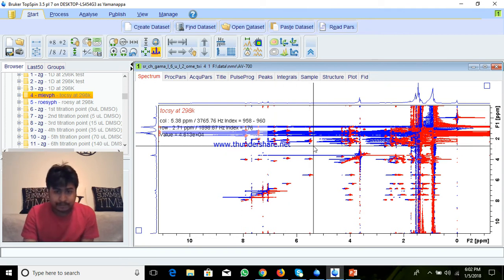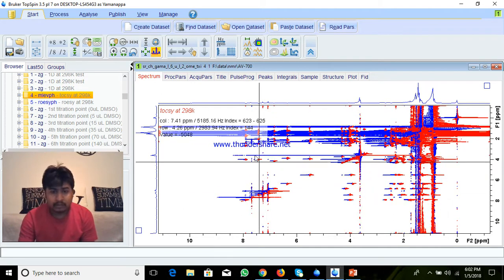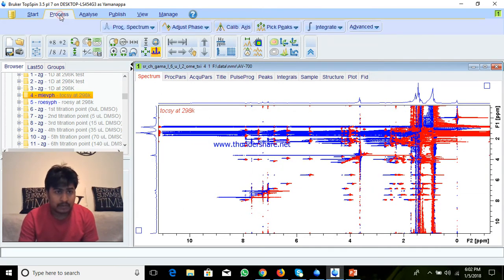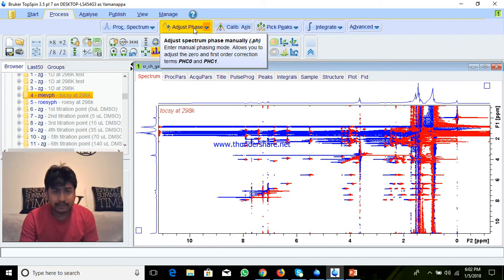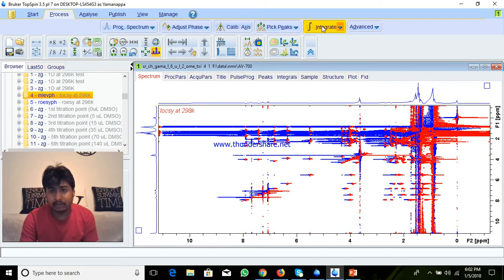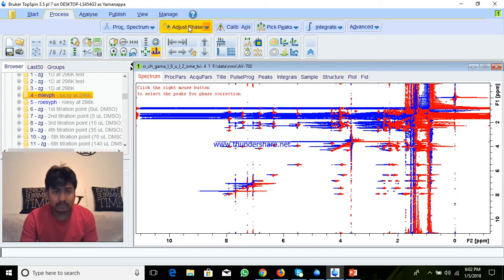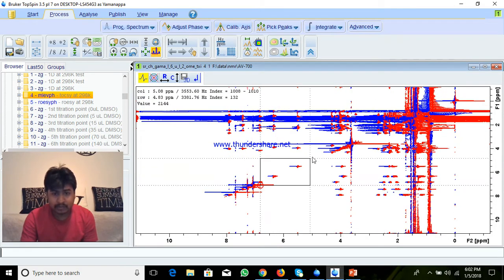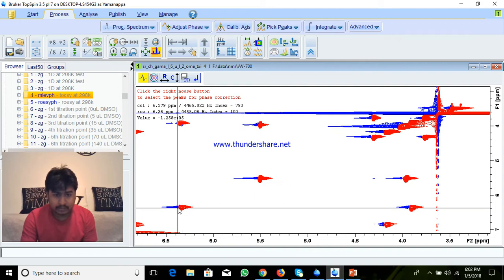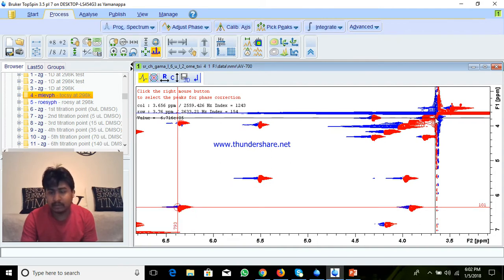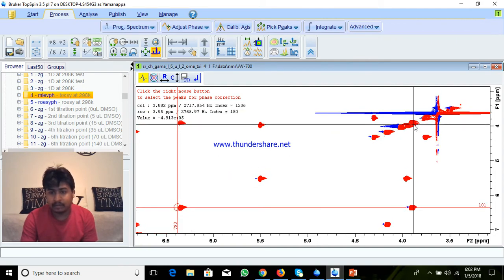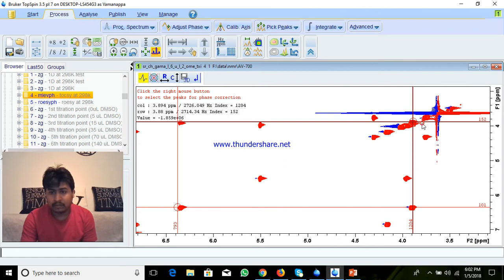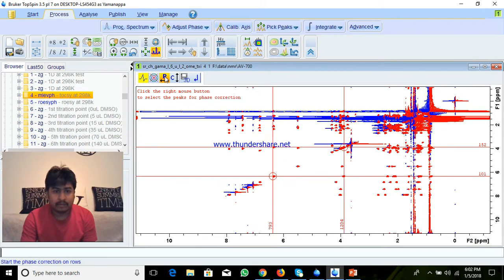In TopSpin, go to Process, and here Adjust Phase and Calibration is there, peak picking and integration options are there. I will do Adjust Phase — you select some peaks, just select and drag, then select one peak here and another peak here, and you can make all. This one is for row.